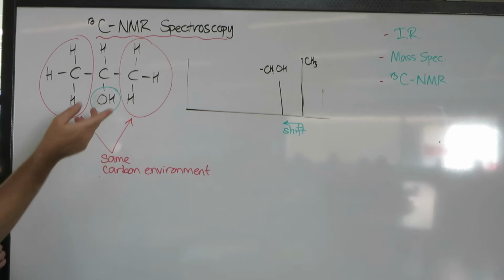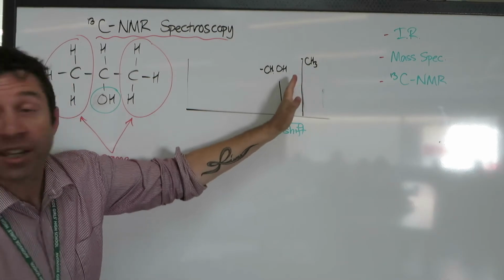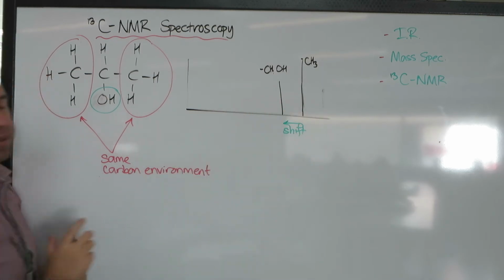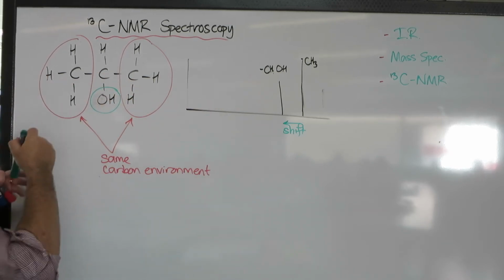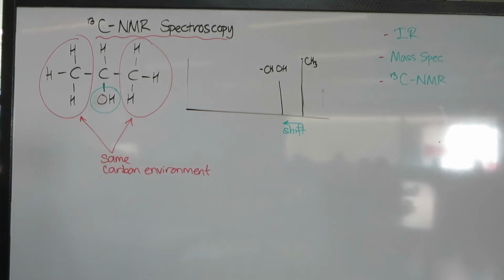So a functional group will cause a shift in the signal. And in this case, the OH bond will shift it just a little bit. And again, you're given the numbers on a data sheet so you can match those up. So you can go, oh, that's consistent with a C-OH shift, so a carbon bound to an OH. Every functional group has a slightly different shift.